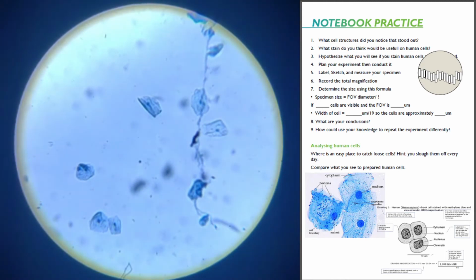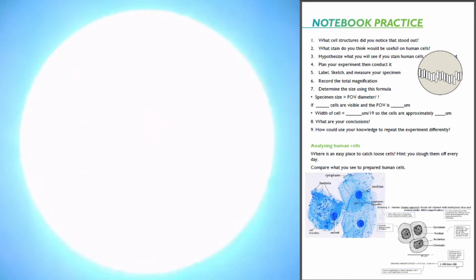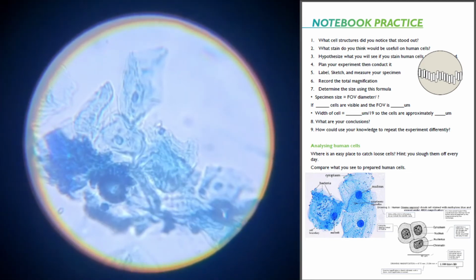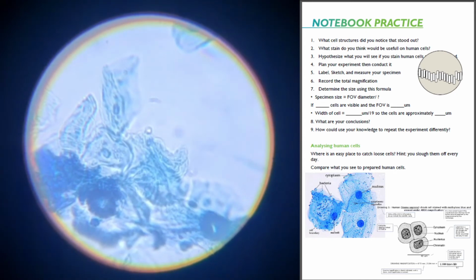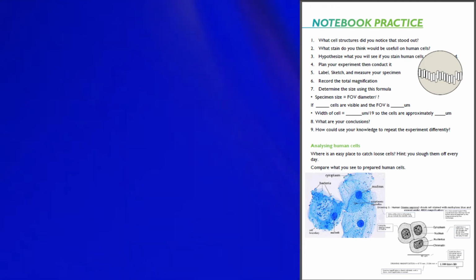Now what I want to do is figure out, can I get a really good image here? Keep touching my slide. Cool. Oh. There you go. It's kind of a cluster of cells. You can see them. You could see them until that went away. Okay, then.